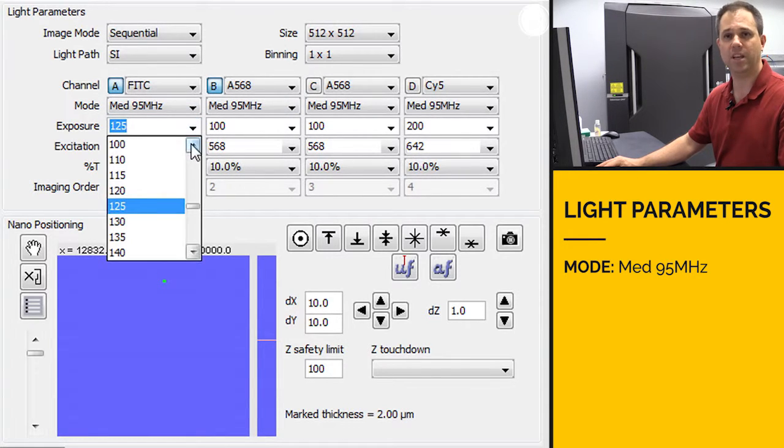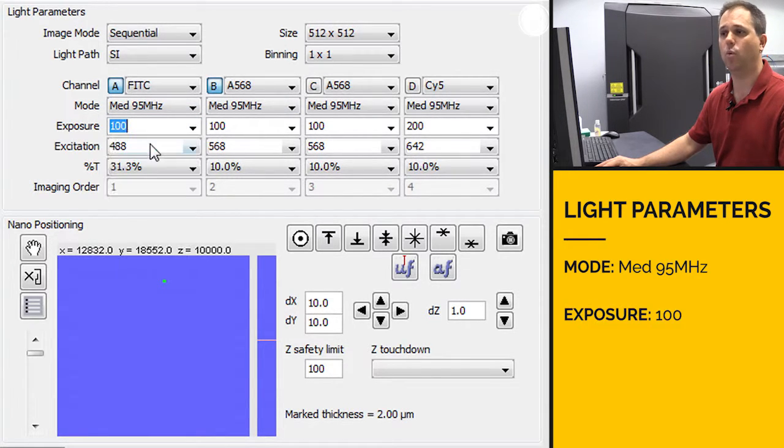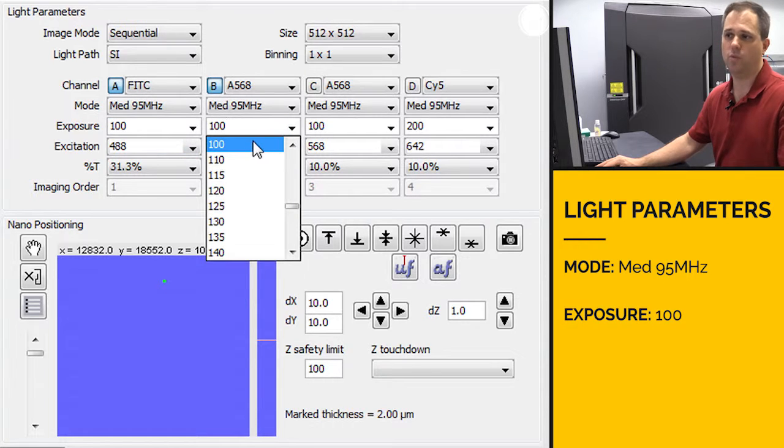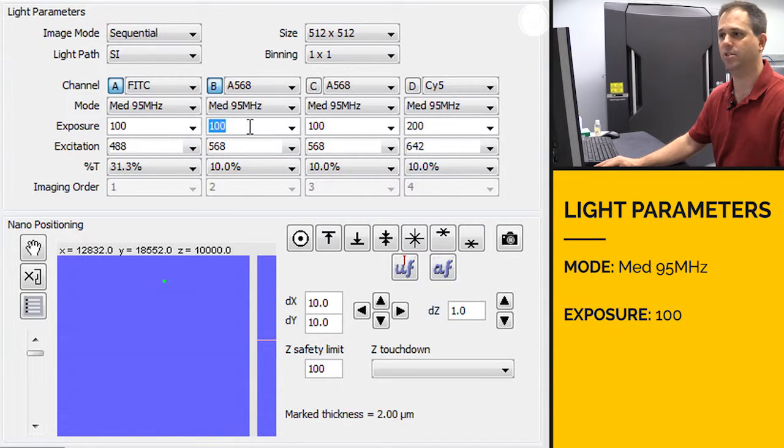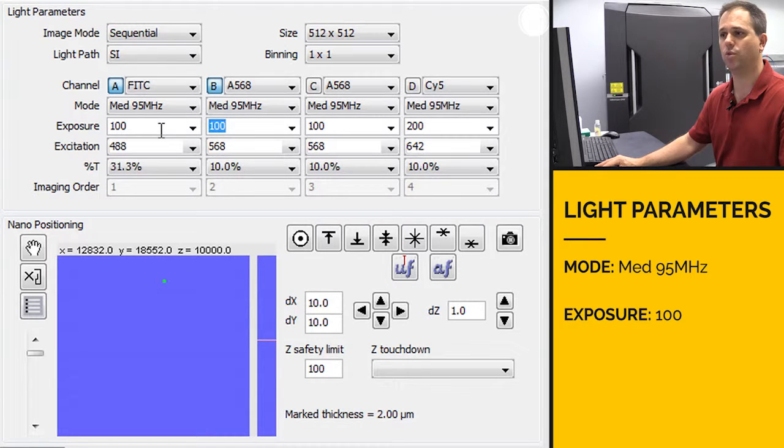Exposure time, we want to set that to 100 milliseconds. We need to start somewhere and 100 milliseconds is kind of a nice average place to start. So we'll set both of those to 100.